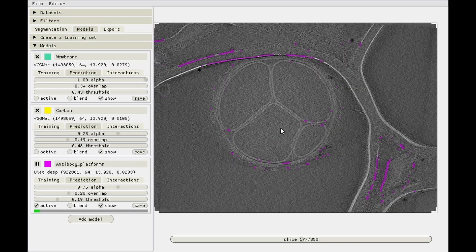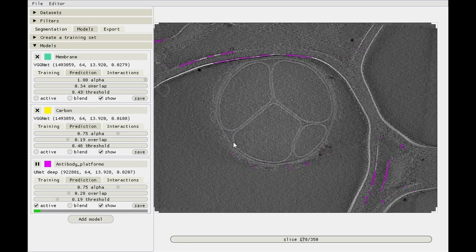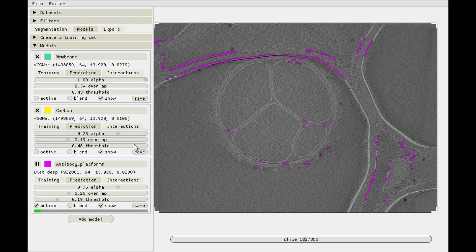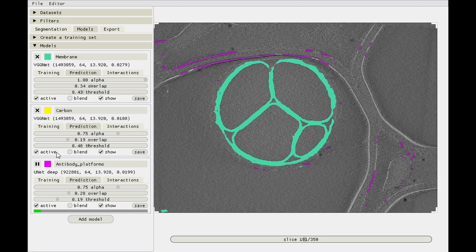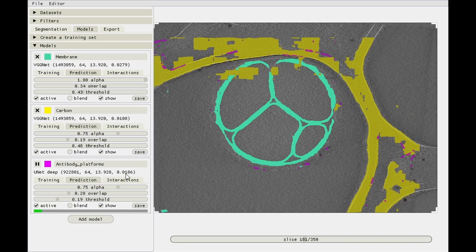But it's starting to look like something. So yeah, carbon and membrane are being picked up which isn't great, but it's also picking up antibody platforms which you should do. And in those same locations the membrane and carbon models are not being activated, so we'll be able to distinguish between these two structures. Training is progressing pretty fast for the UNet Deep. It could probably run for a little bit longer to get better, but let's just stop it now.